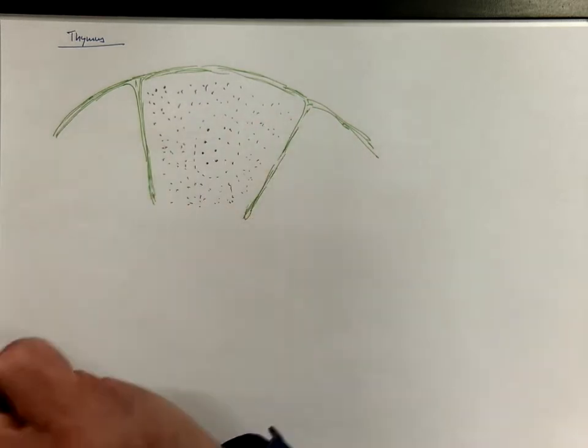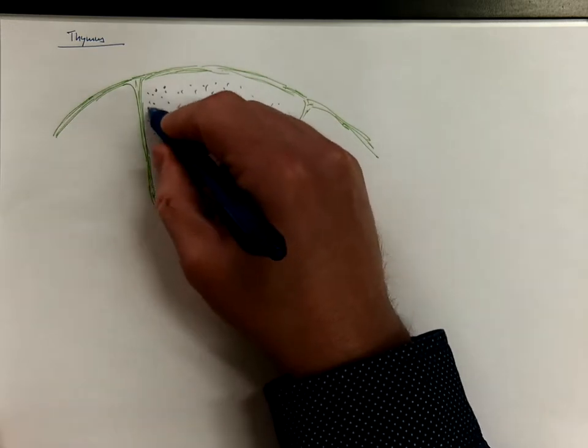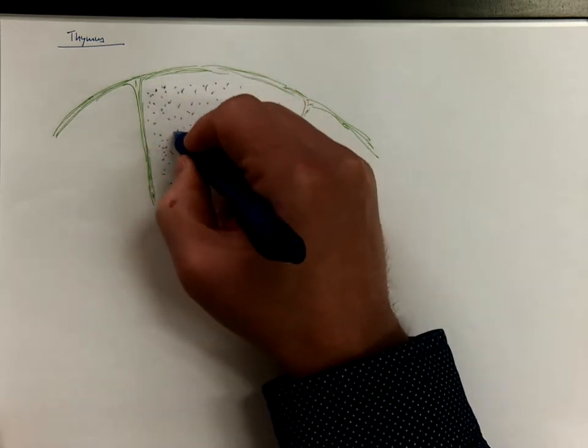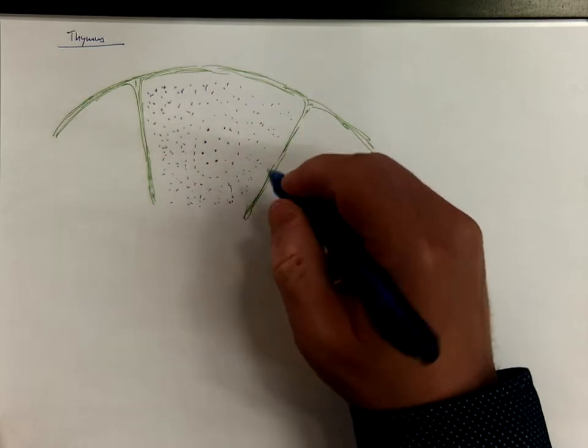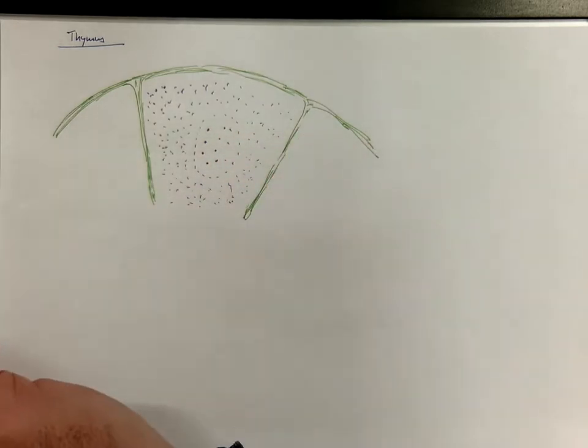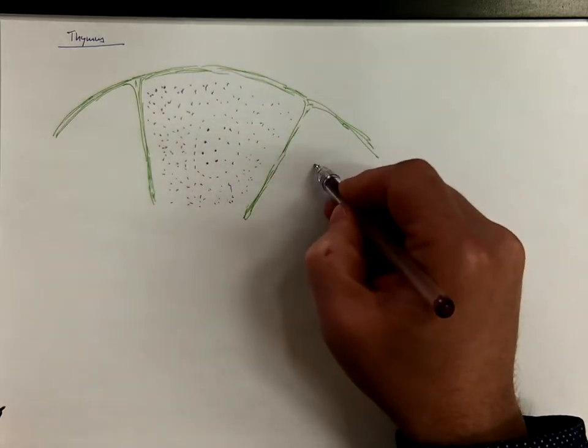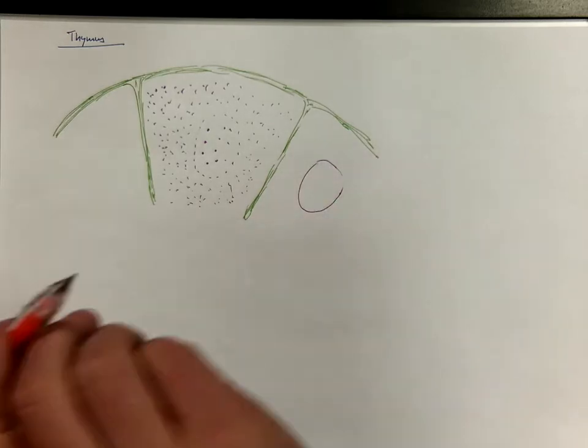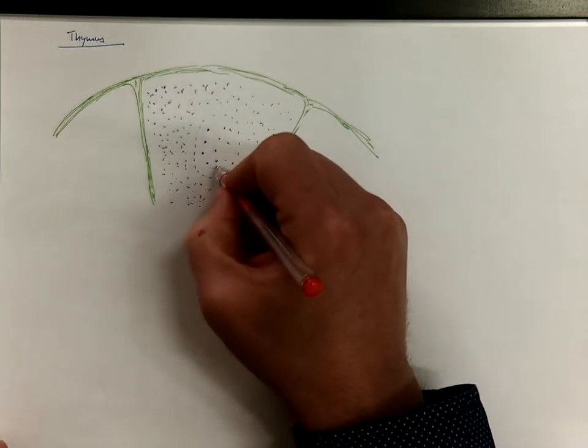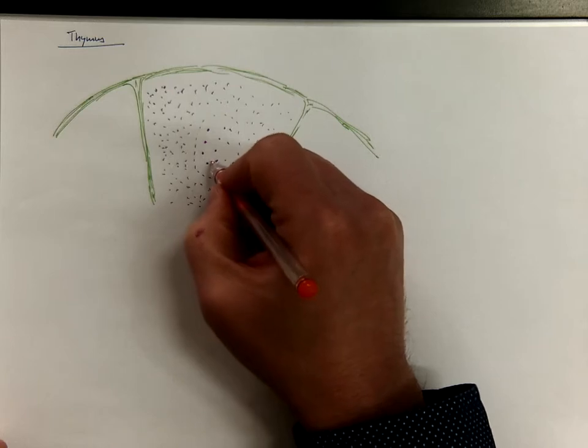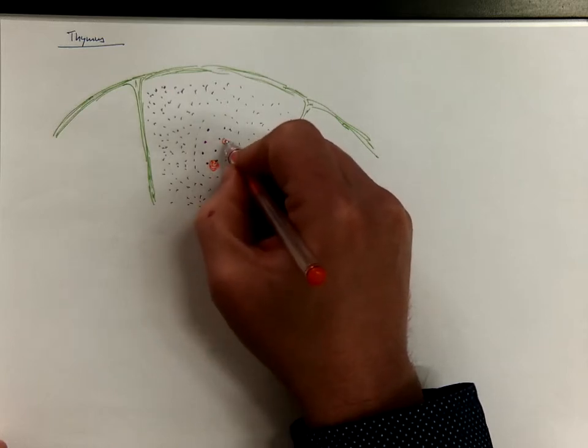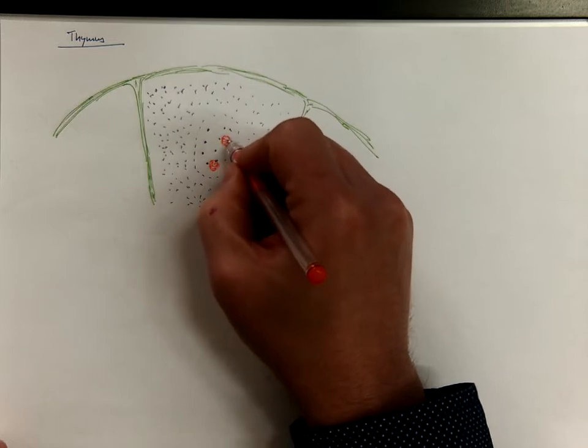We've got this darker cortex and more pale medulla. Moreover, the medulla contains eosinophilic concentric structures called Hassel's bodies, which are collapsed epithelial cells.